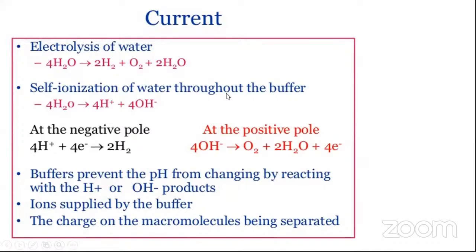And apart from electrolysis only, as there are buffer ions which act just like electrolytes, these ions will be reaching the respective electrodes depending upon their charge status. So what do you think, if you increase the potential difference, will there be increase in current now with this understanding about the electrophoretic procedure?